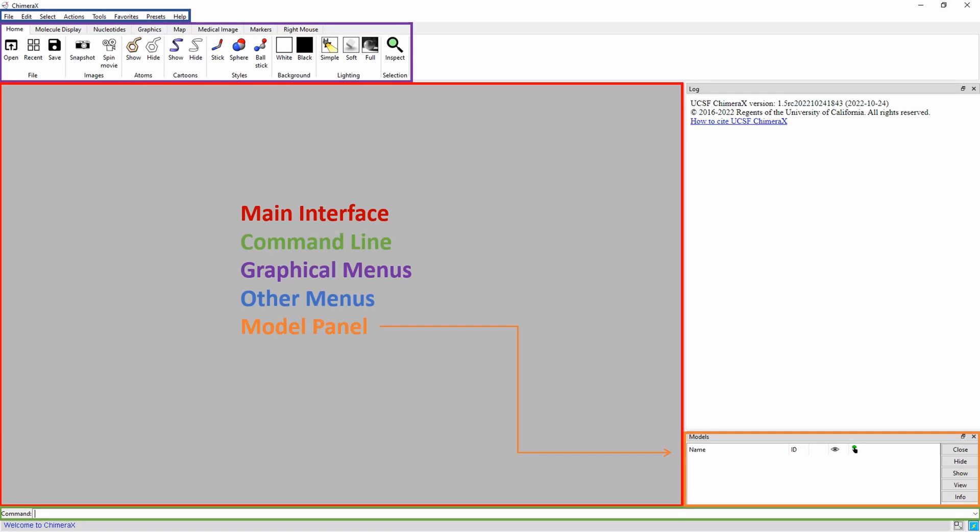The model panel, highlighted in orange, gives a summary of the models in use during the session. This section contains information about model names, ID numbers, color, visibility, and selection status.